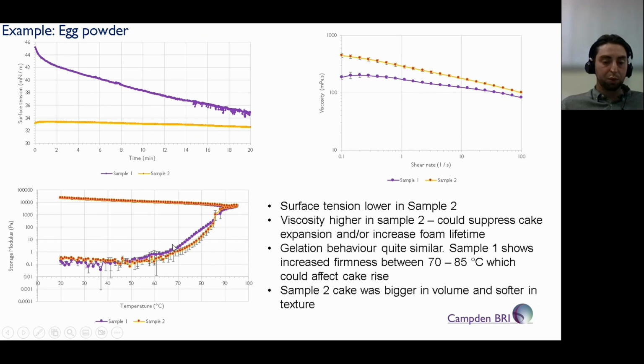The purple one, sample 1, set earlier and stronger. The straight line at the top going backwards, is it cooling? And it seemed to cool to a very similar point.